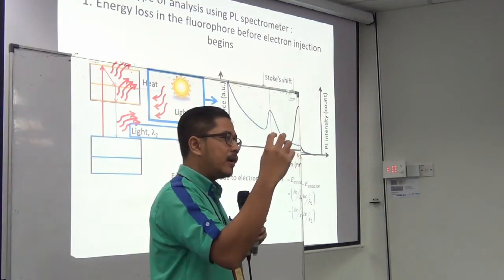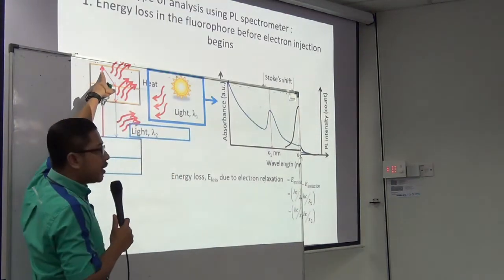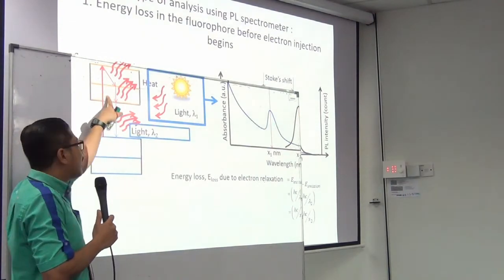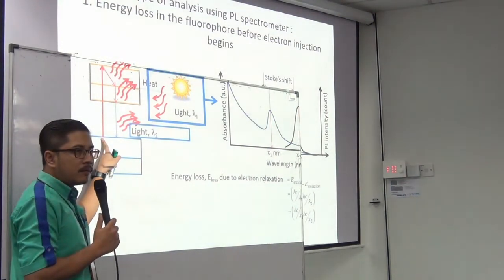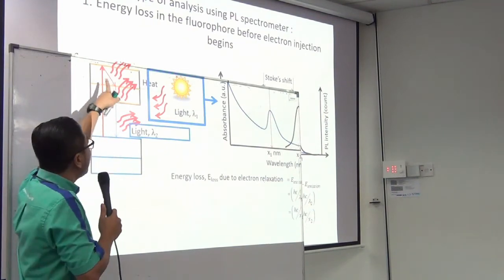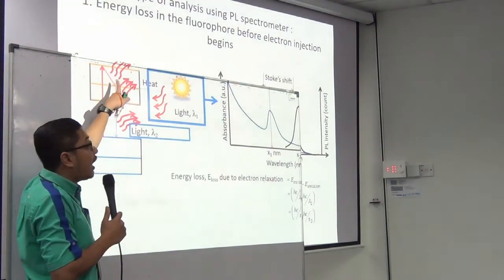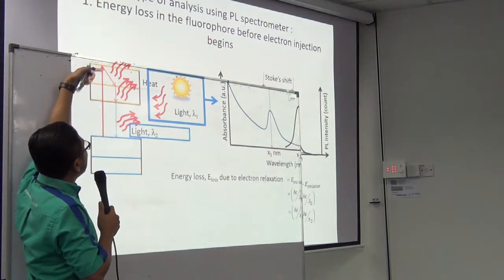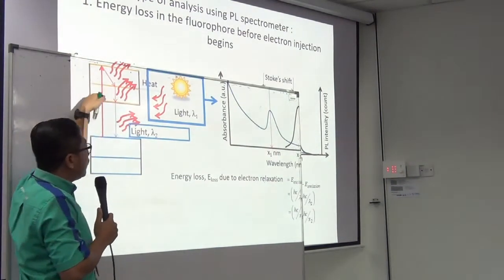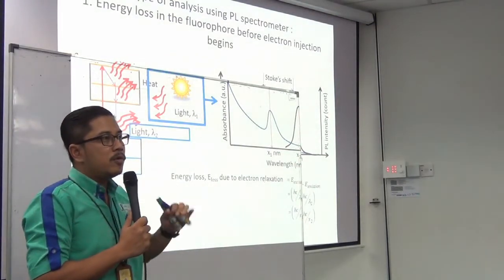The electron must not recombine with the hole in the valence band, because then it is no longer mobilized. We need to maintain the electron at the unoccupied energy levels, whether LUMO 0, LUMO 1 or LUMO 2, in this region.